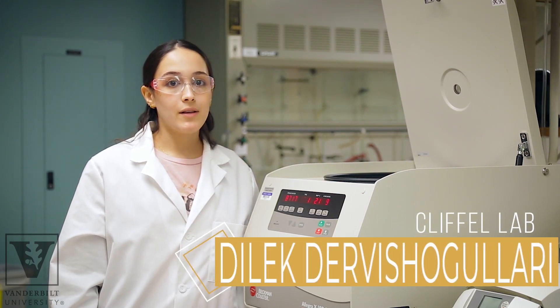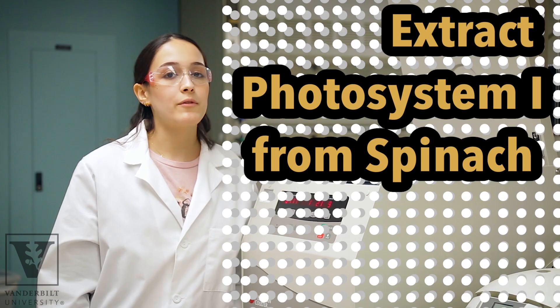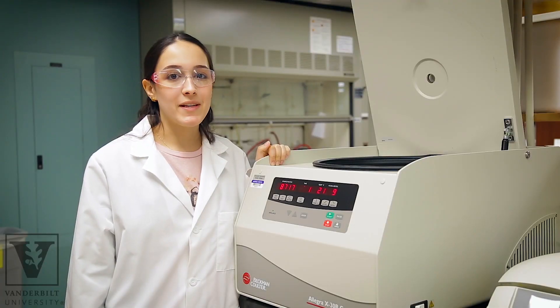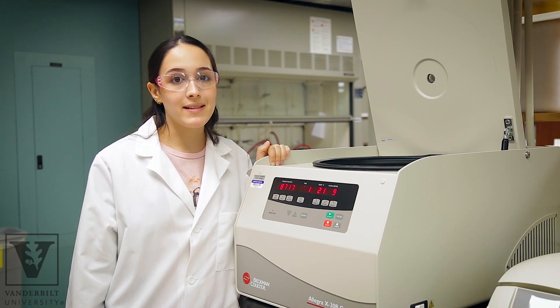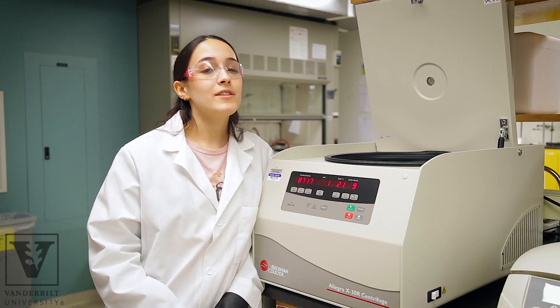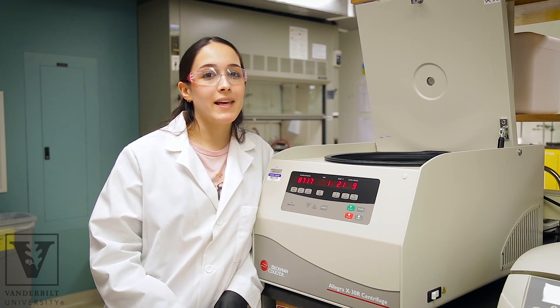To make a plant-based solar cell, we need to extract a specific protein called Photosystem-1, or PS-1 for short. We first blend the spinach, then separate the heavier materials like fibers and plant cells using a centrifuge like this one. After the extraction process is done, PS-1 can be stored in a freezer for later use.